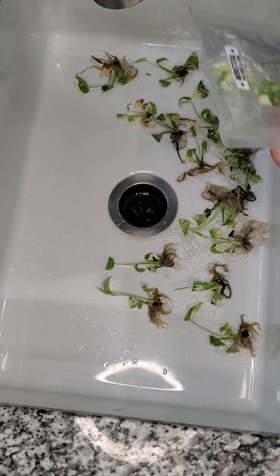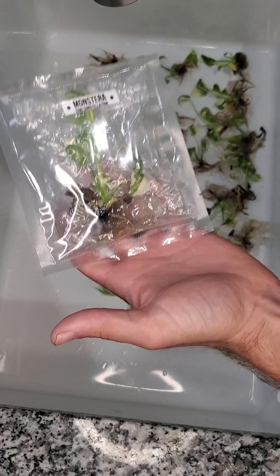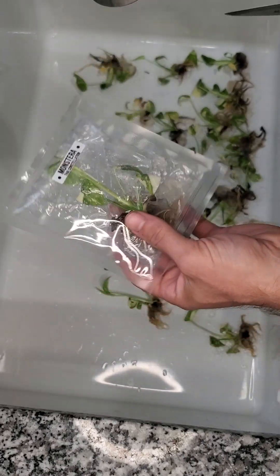All right, so we have a bunch of ties here we're in the process of doing. This is the one we looked at outside. This is the one I'm going to be showing you the entire steps on.